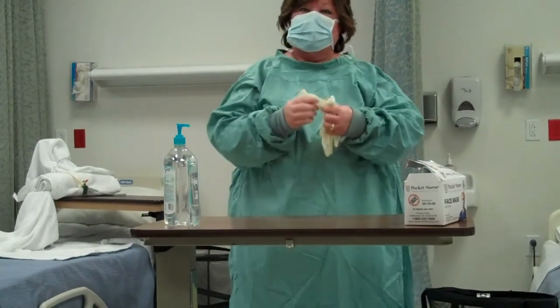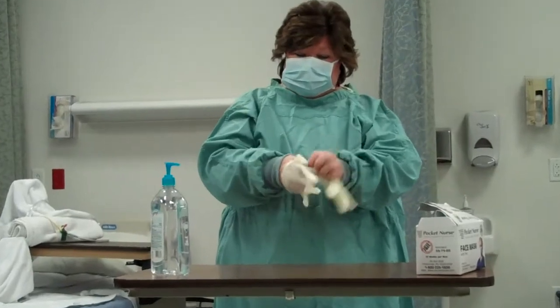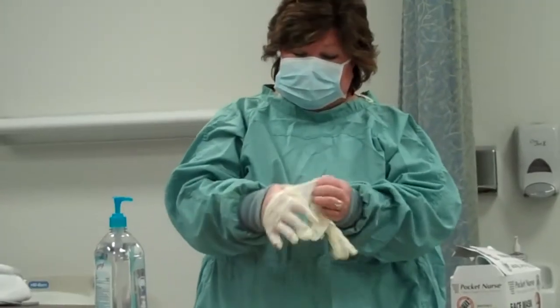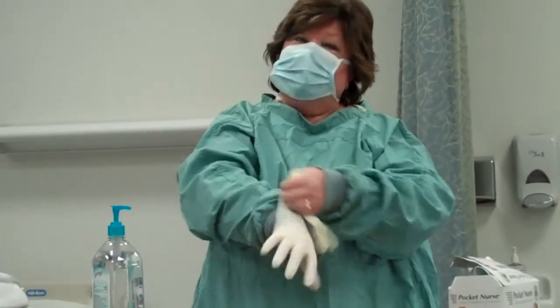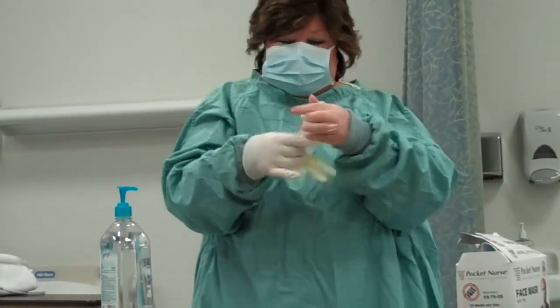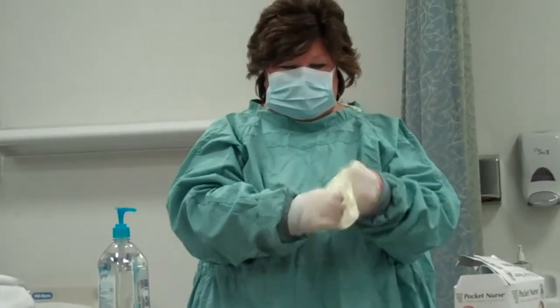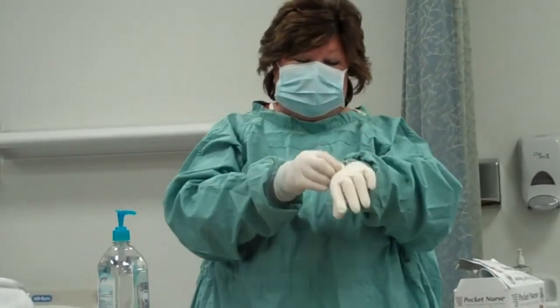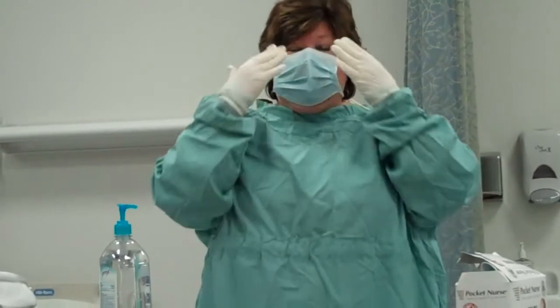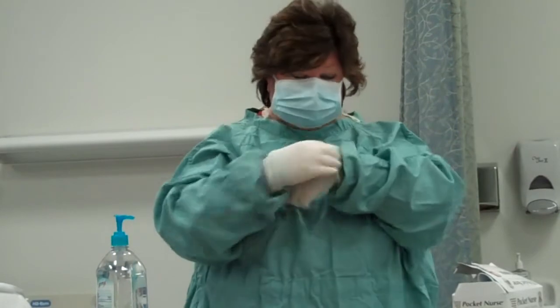Okay, so the last thing I'm going to do when I'm gowning up is putting on my gloves. My hands are already washed, and I want to make sure that my gloves cover the cuffs. If I wore eyeglasses, I would want to make sure that my mask went up underneath my eyeglasses so that I'm protected.